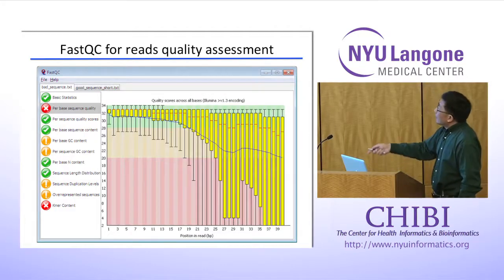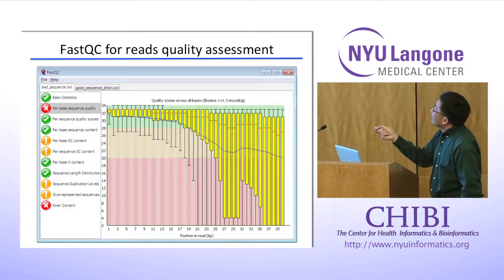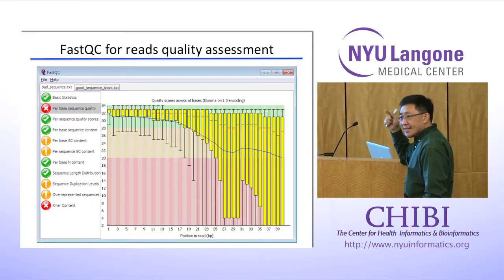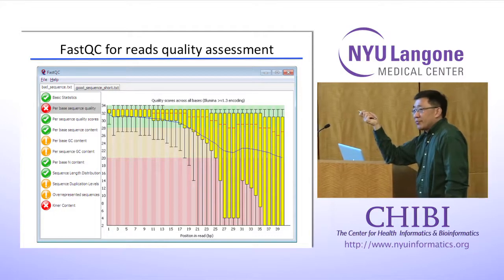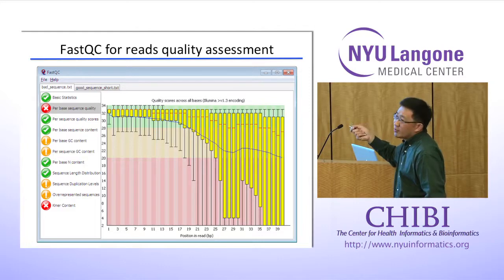So the fourth line I mentioned earlier is the sequencing quality assessment score. Here you don't really see a score, but you can see lots of numbers and signs from the keyboard. This is actually ASCII code. What you need to do is translate this code back to a decimal number.